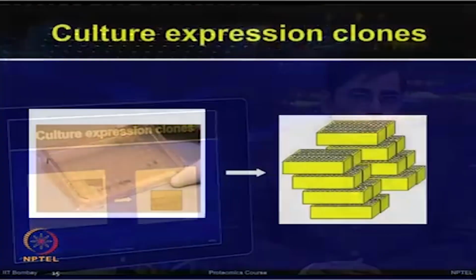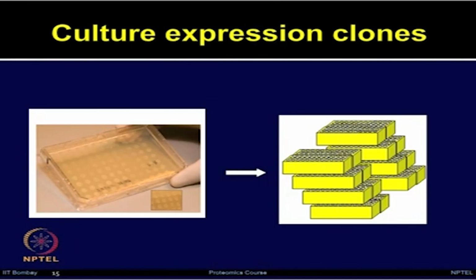So, the DNA preparation process is very similar to what everybody performs in a regular molecular biology lab. The only difference here is that the steps have to be automated and in a more high throughput manner, because if you are working in tubes, you are doing 5 or 10 genes, you cannot achieve the 20,000 density. So, all these steps need to be automated. For example, I have shown on the left slide the inoculated liquid cultures on the LB agar plate, and then those can be used for inoculating a large number of blocks for doing the DNA extraction.